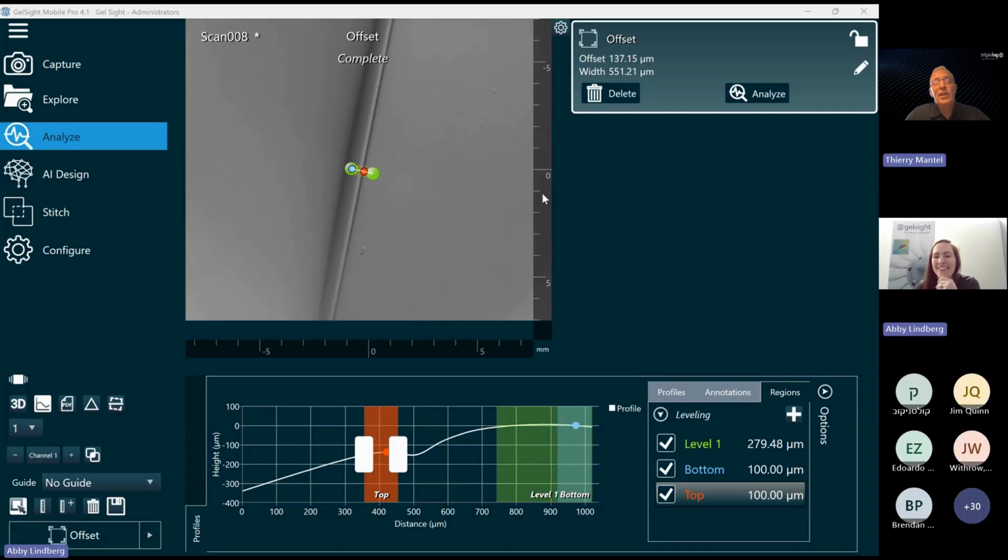Yeah, you're right. Just to remind also, the calibration of GelSight remains the same for any type of material. You don't need to redo things if you switch from glass to carbon fiber or to textile or fish scale. It's always the same setup of the system.